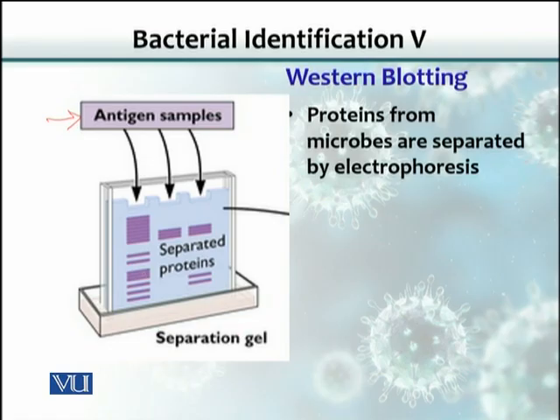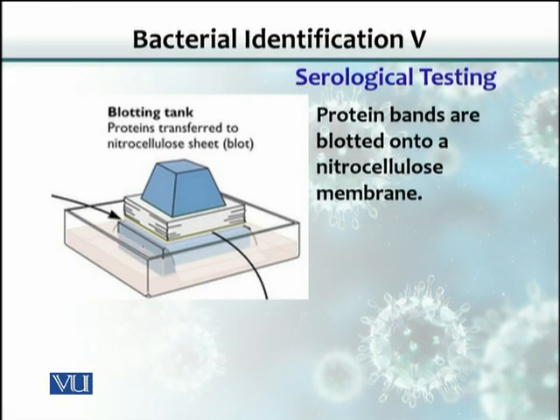When these proteins get separated, we can transfer these proteins onto another membrane called nitrocellulose membrane by soaking the gel with high salt and keeping the filter on the gel, and then that filter is stacked with lots of paper.